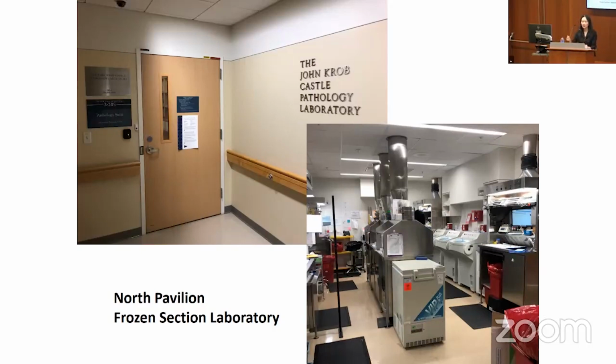I'm not showing the other section of this room, which is a whole table where our accessioners are. So they are intaking the bone marrow sample. And what they're doing is, each case, so each little sample, will have a barcode. And so once we receive that and it's barcoded, it is tracked with the patient medical record. It is tracked from start to finish. And so we never lose a sample once it's received in this room.